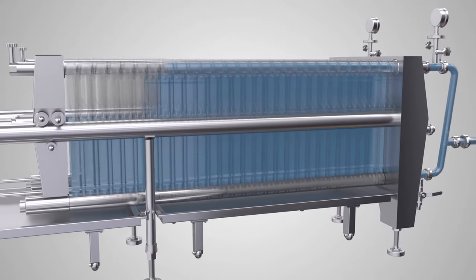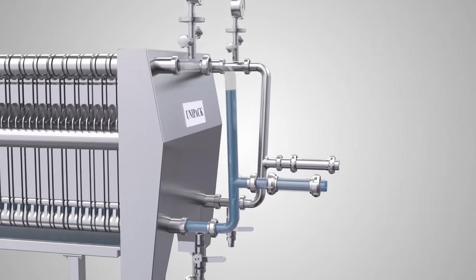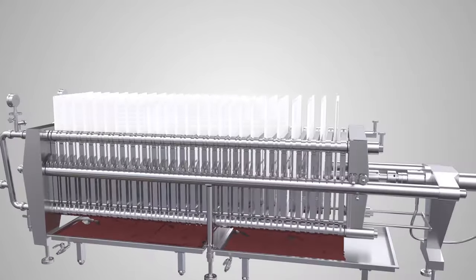Similarly, a blockage plate is offered to achieve the flexibility of using the same unit with reduced filtration area.